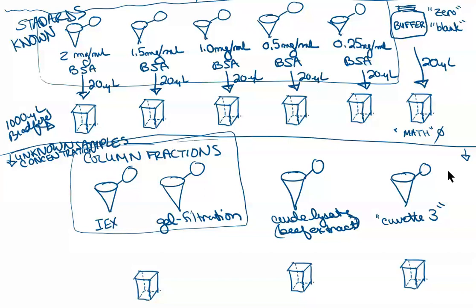And I think that I asked you to dilute 20 microliters of your column fraction and 180 microliters of buffer. And so both of these materials were added into this snap cap, okay? So there's two things that were added in.